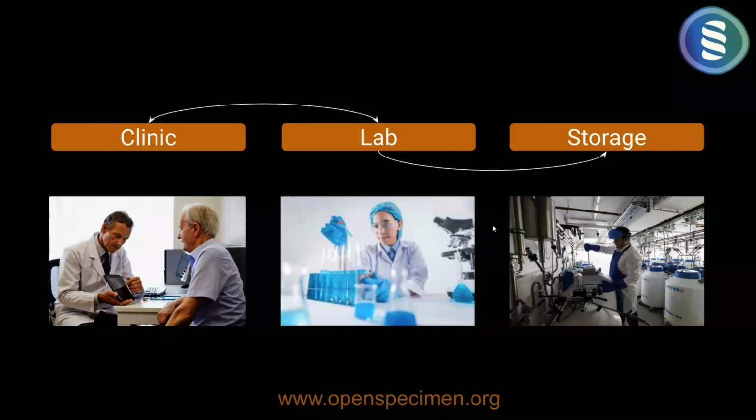on a desktop or a laptop, because finally everything depends on the real estate on the screen, right? So some things need larger screens, and are better done on larger screens, where you have a lot more time to do something like that, versus some things that don't need large screens, but the convenience of handling the device and the ability to do it when standing, when sitting, when roaming around is more important than the screen size per se. So it depends on those kinds of use cases to decide.